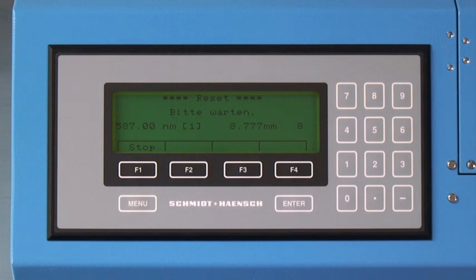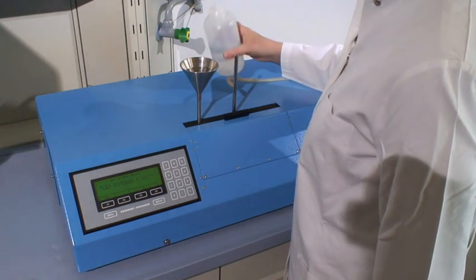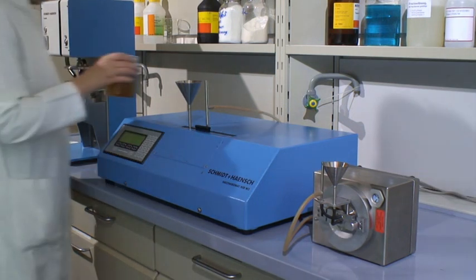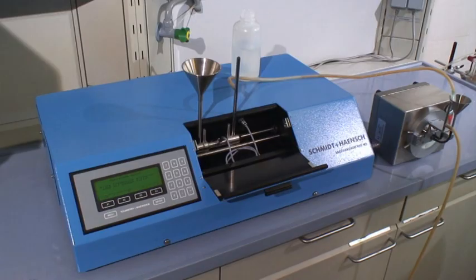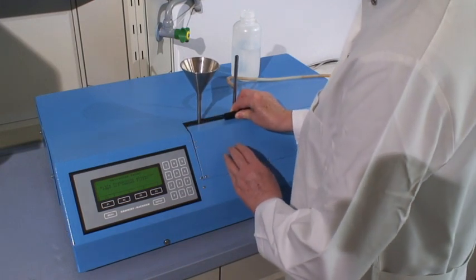For preparation of the polarimeter, the instrument should be set to zero at 882 nanometers by following the instructions of the menu appearing on the display. First, the clean flow-through tube should be filled with distilled water and after a short time, the reset function of the polarimeter should be activated. Herewith, the absolute zero of the polarimeter, Polytronic or Sacramat, will be set. A sample volume of about 150 millilitres is needed to flush the distilled water or the previous sample out of the tube and provide enough sample volume for the actual measurement. The tube is connected via a temperature sensor with the instrument and automatically corrects the temperature of the sample to 20 degrees, which is normally the reference temperature.